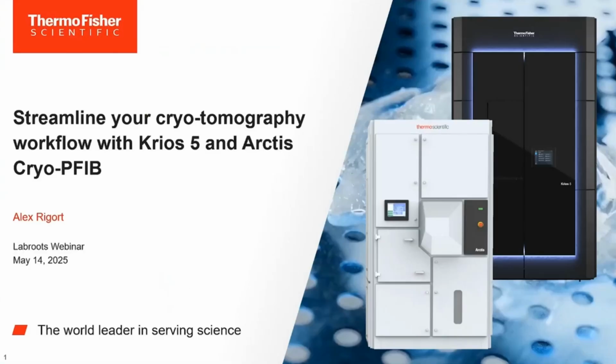Yeah, thanks very much for the nice introduction into the new Krios 5. My name is Alex, and I would like to show you how the Arctis cryo-plasma FIB system can be utilized to produce samples for the new Krios 5, and how the combination of both instruments can streamline your tomography workflow.